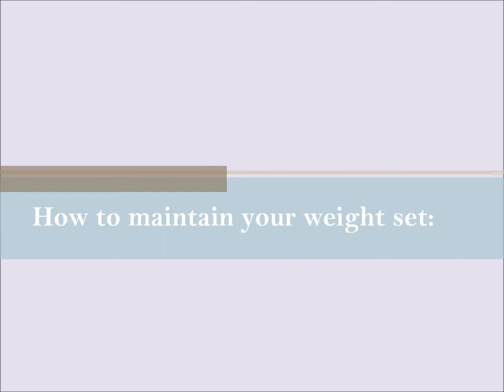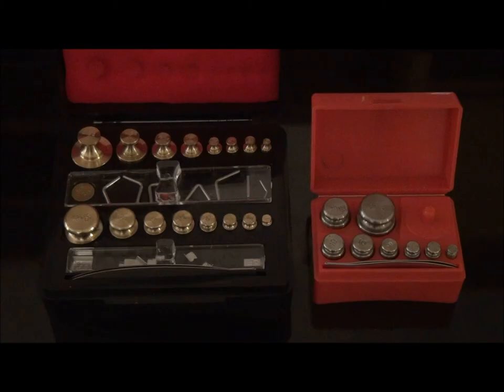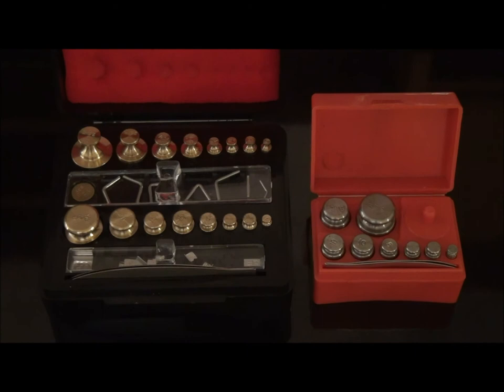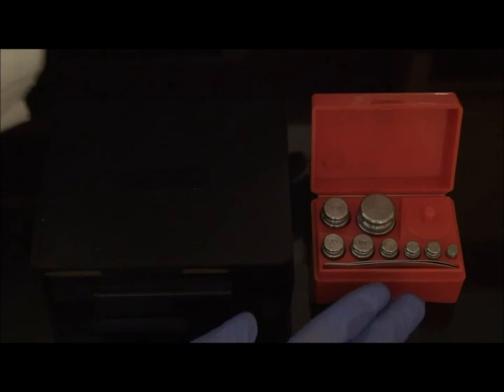We will now go over instructions for proper handling of weights. When handling weights, it is important to always use forceps. Never handle weights with your bare hands or dirty gloves, to prevent the accumulation of body oils, chemicals, and debris which may compromise the true measurement. Forceps included in more expensive sets are tipped with bone, ivory, or plastic to prevent weights from wearing away with handling. When the weight set is not being used, it should be stored in its original packaging in order to prevent accumulation of foreign matter and corrosion to the surface of the weights, which may affect weighing accuracy.